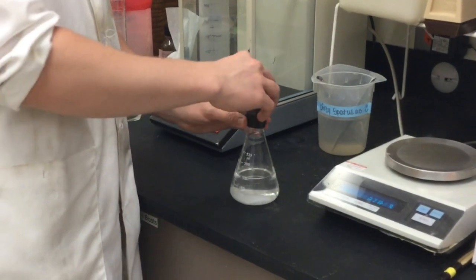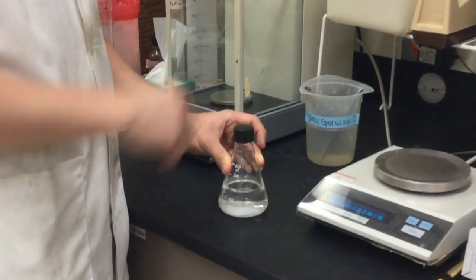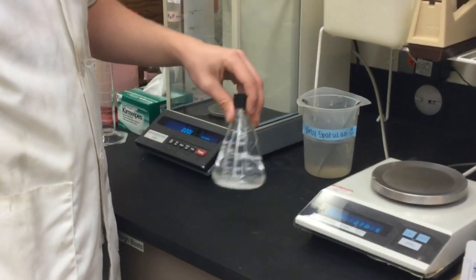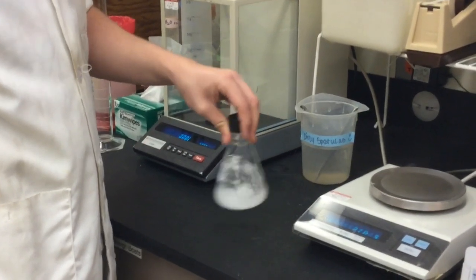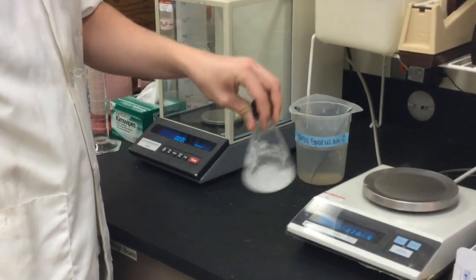Now we will add the cap back to the flask and swirl the flask in order to dissolve the sodium chloride crystals. We will do this until the solution is clear and all the sodium chloride crystals are dissolved.